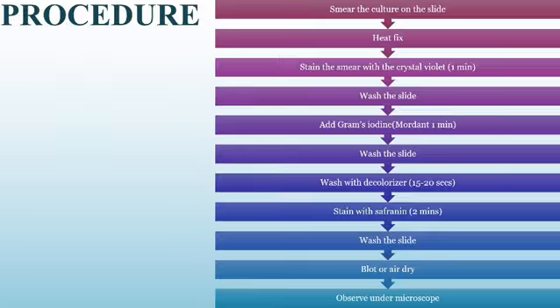As a result, gram negative bacteria appear pink in color, and so this is called a differential staining technique, as these two groups of microorganisms are differentiated based on the color of the dye they retain. Gram positive bacteria appear purple and gram negative bacteria appear pink.